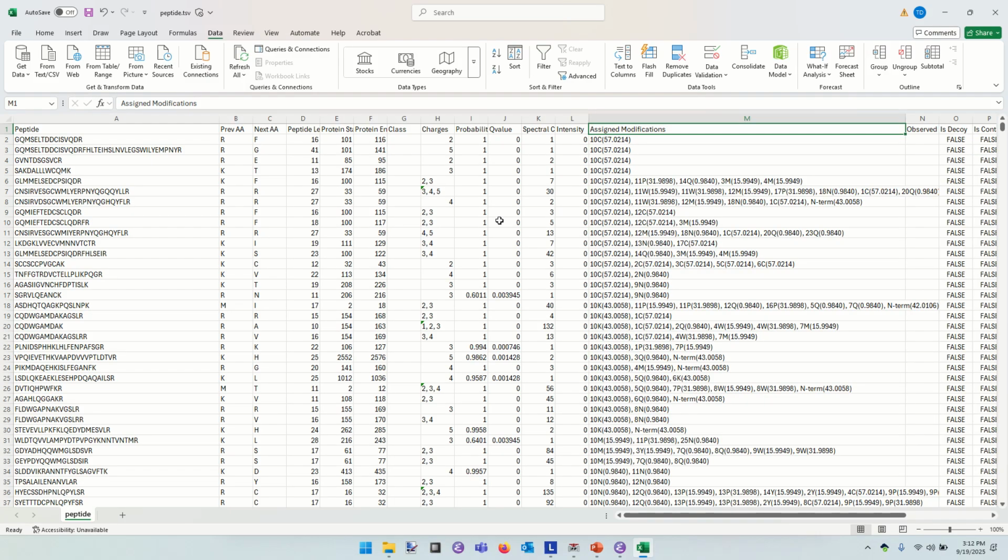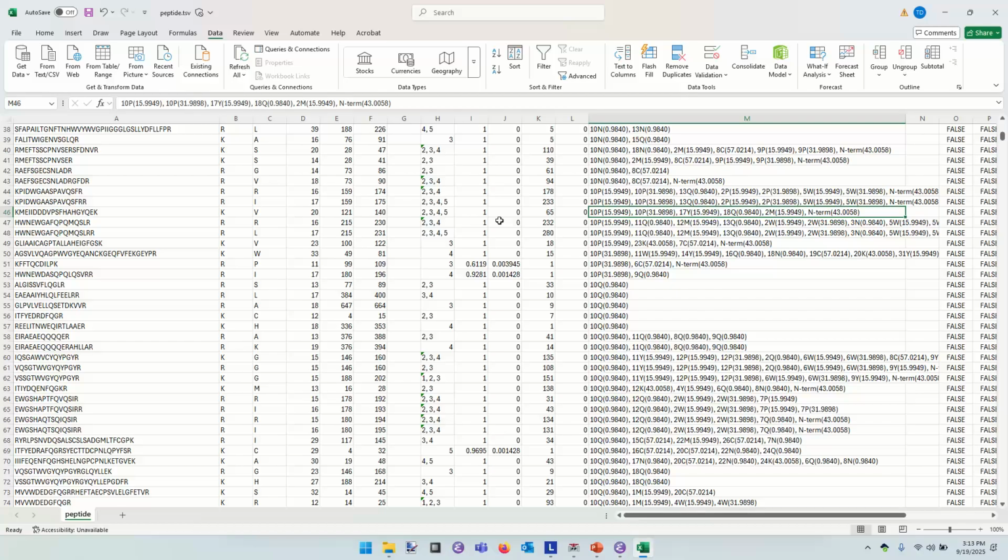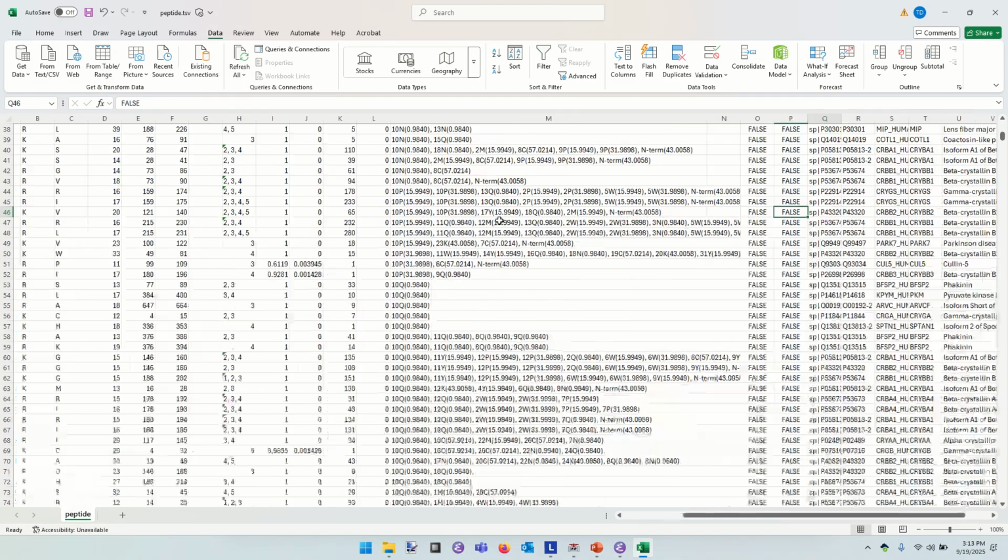And a lot of software will produce that. This one doesn't seem to. So that's kind of unfortunate, but it is possible for us to do histograms, for example, on how many of these bore each combination of PTMs. You could do that. It's a little tricky because it has that information about which particular amino acid in the sequence bears that modification.